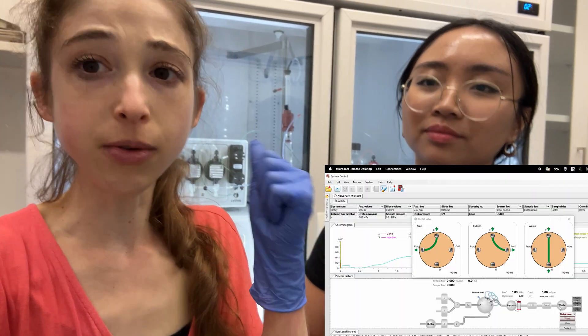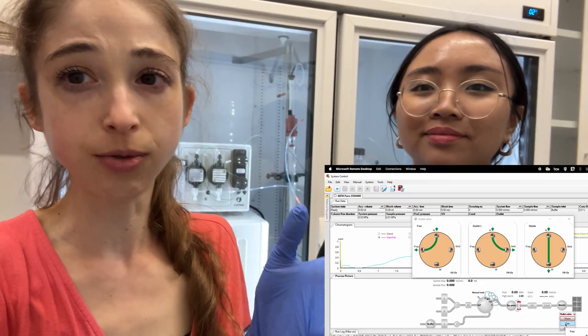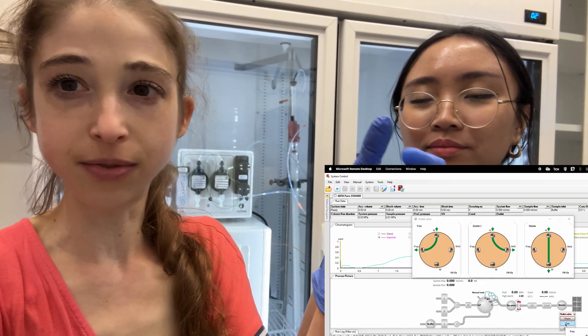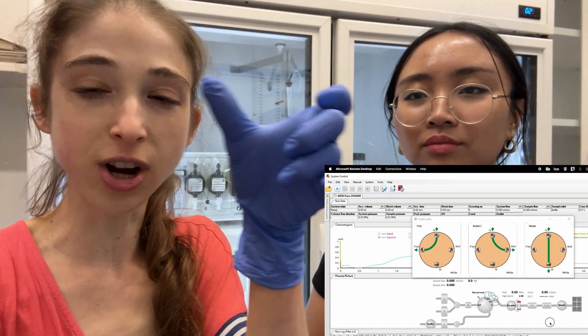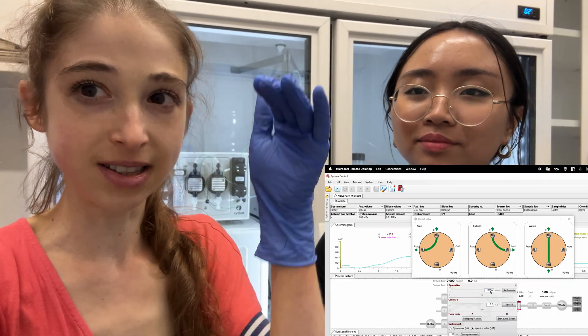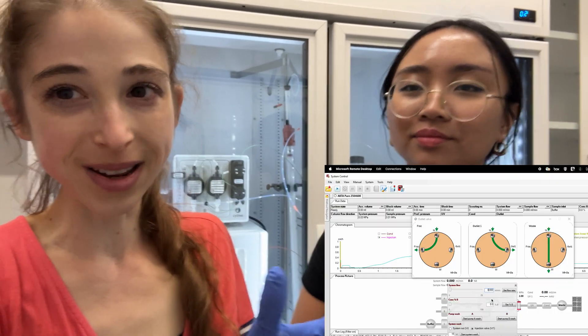But you want to wash that fraction collector line after each run because that's not, by default, getting washed when you're washing your column, whereas the rest of the tubing would be.